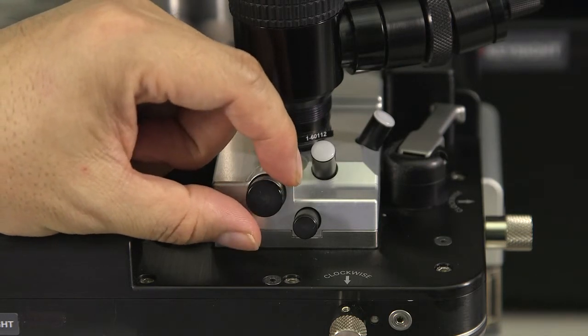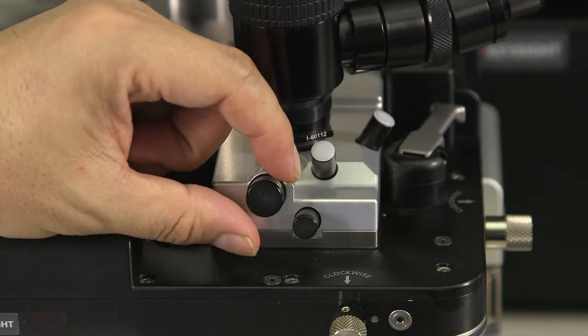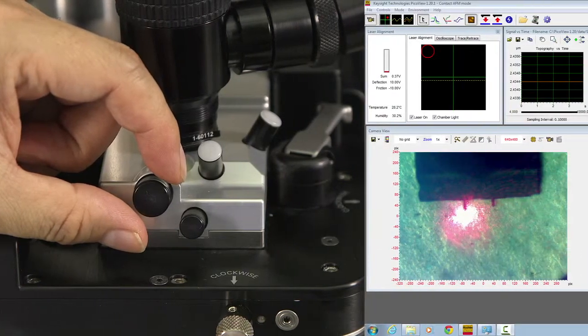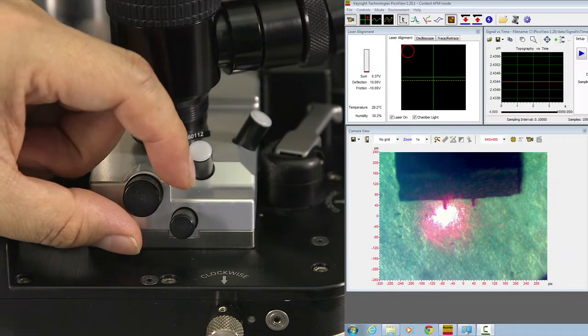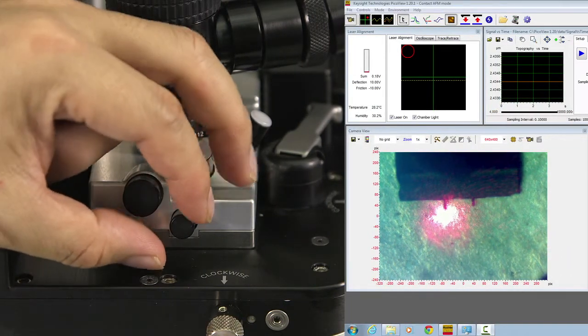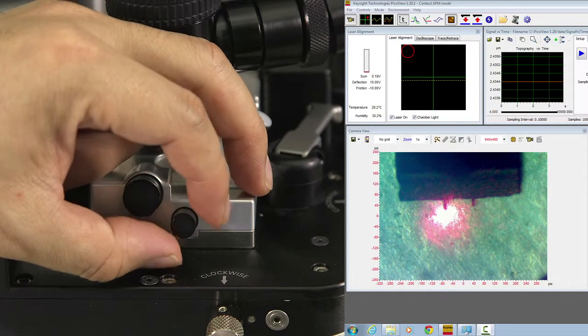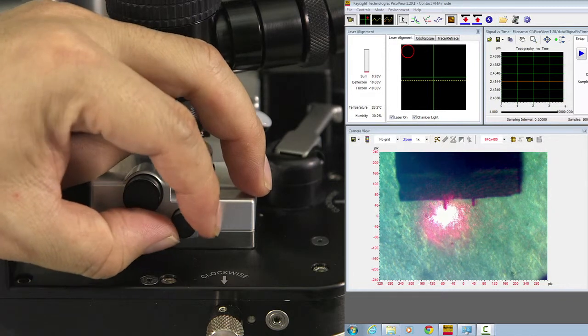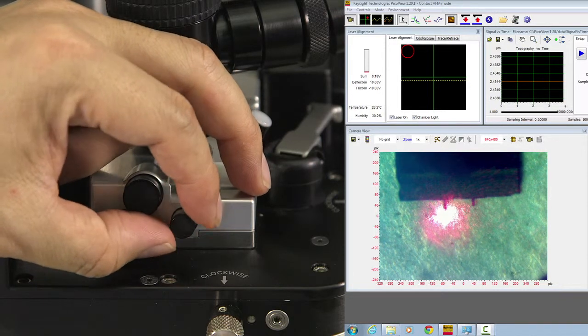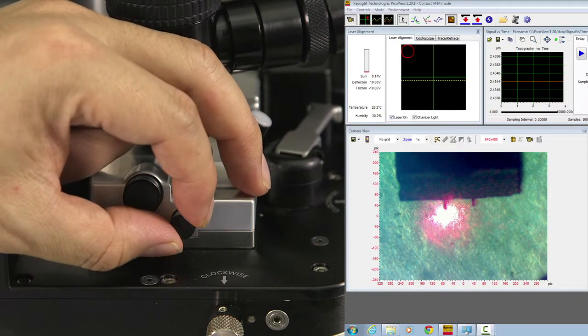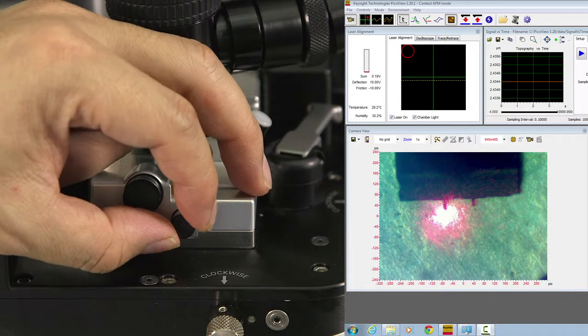Now, let's look at the computer screen, the laser spot. First, we move the small knob left and right. Don't look at the laser spot, the red dot.